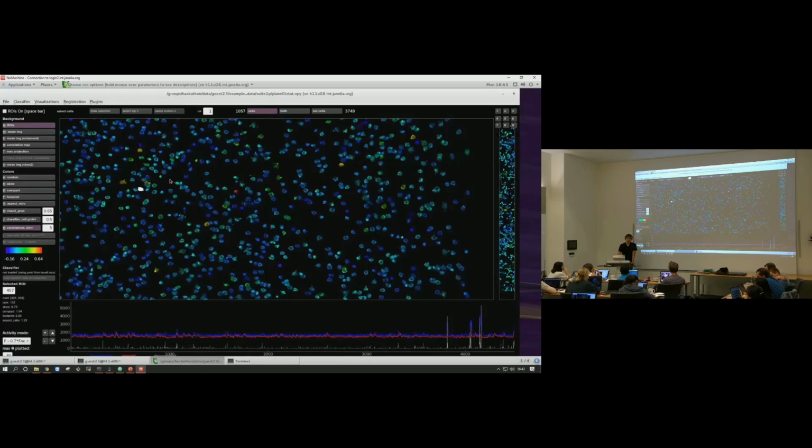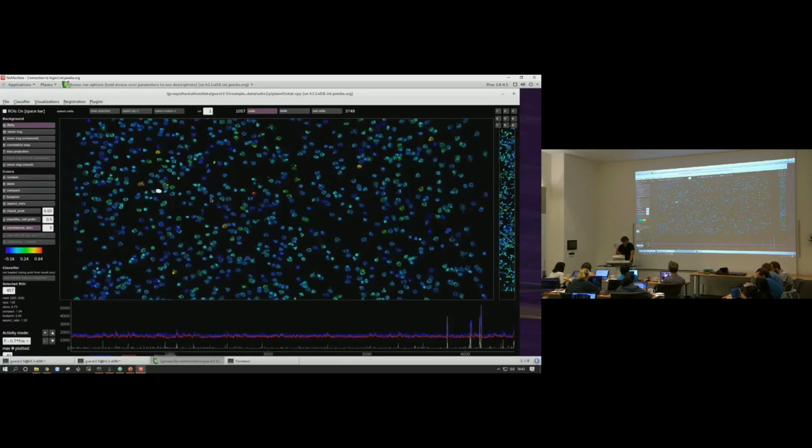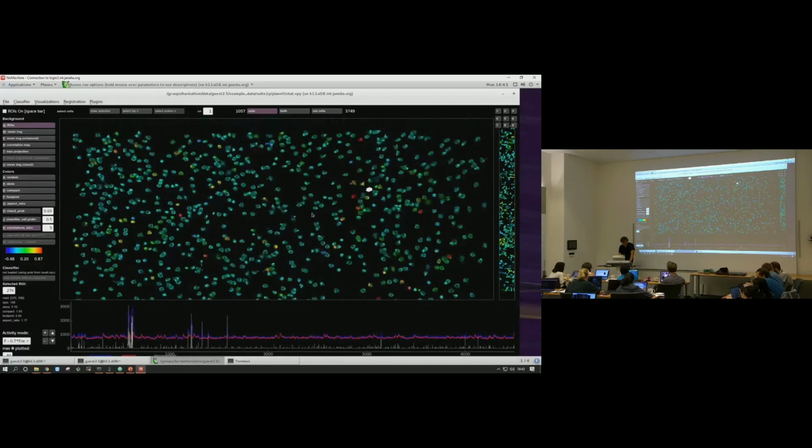Yeah, this is the high motion example. Okay, never mind then. It wouldn't look too different. I have an example with visual responses in just one moment. But this is spontaneous activity, so there's basically no structure in the patterns of correlations between cells.